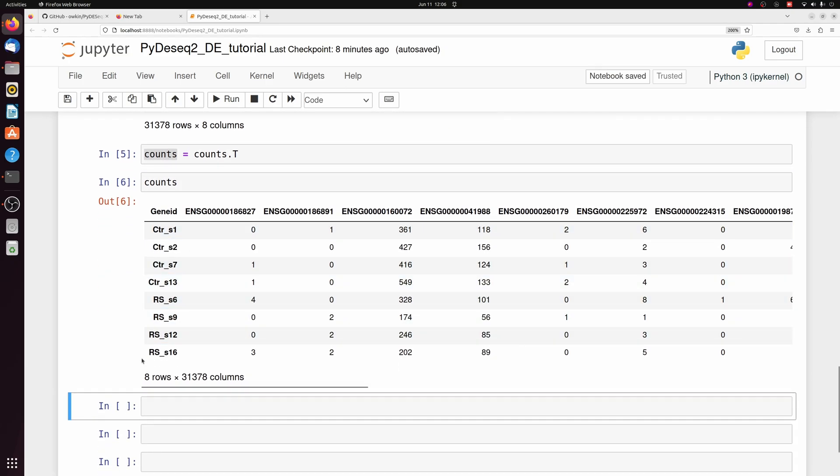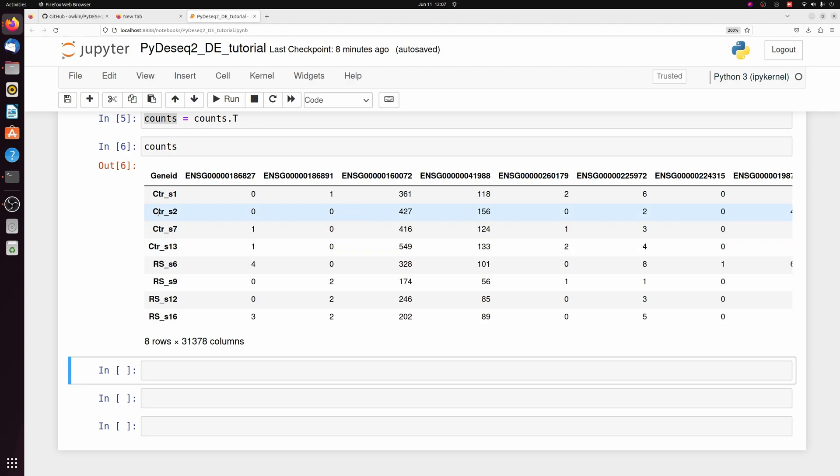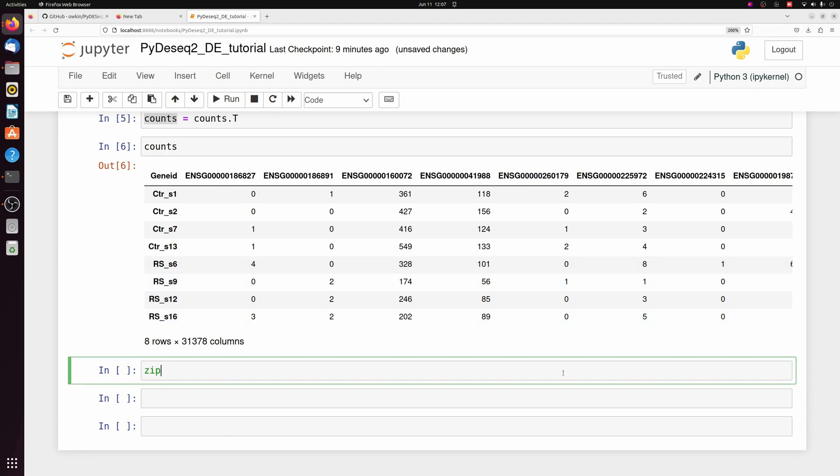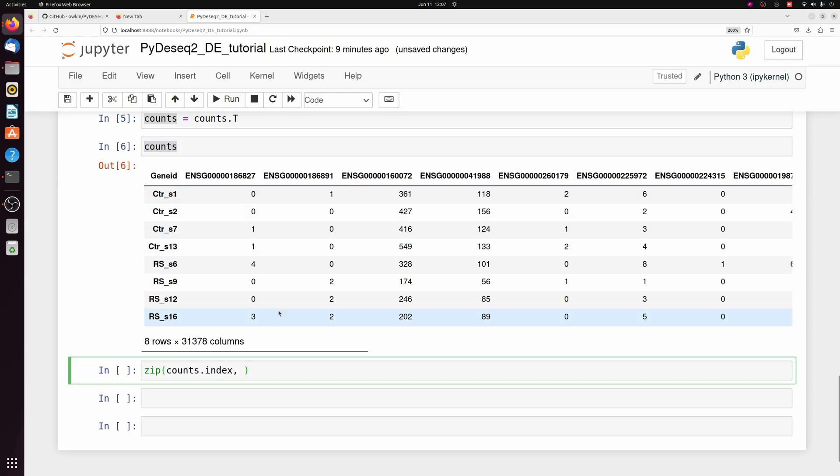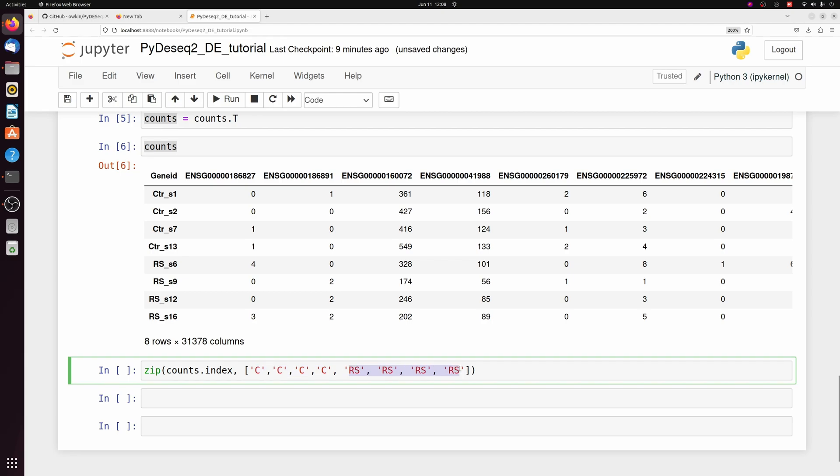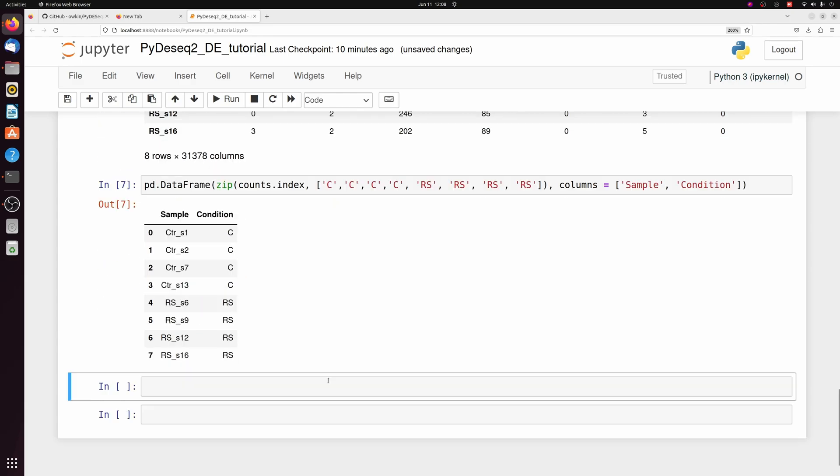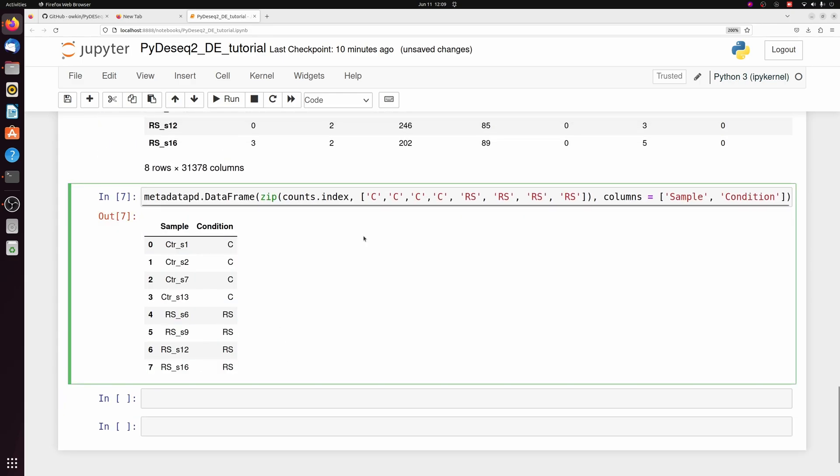We need to now prepare the metadata for this data set. I don't actually have a separate CSV for the metadata, so I'm just going to create a metadata data frame from scratch. So I have four control samples and four replicative senescence samples. I'm going to zip the index column from counts, which is just these sample names, and I'm just going to manually input a list for the condition. The first four samples, I'm just going to label C for control, and then the next four as RS for replicative senescence. And then I can wrap this directly in a pandas data frame and specify the columns as sample and condition.